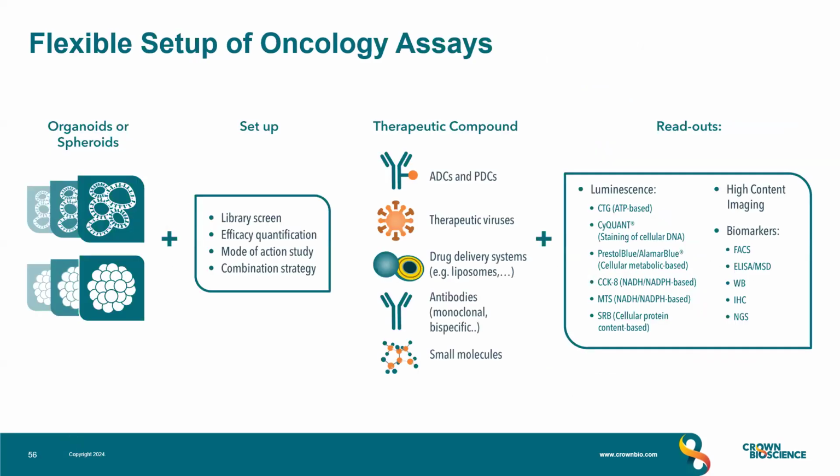And then generally the 384-well format allows a high degree of flexibility when working with patient-derived models, such as the organoids, but also the PDX spheroid models, seeing as for some PDX models we don't have matched organoids, so we do have to still rely on using the PDX as a source of tissue for some of the in vitro 3D spheroid modeling. And there are a number of different options in the setup to achieve different objectives.